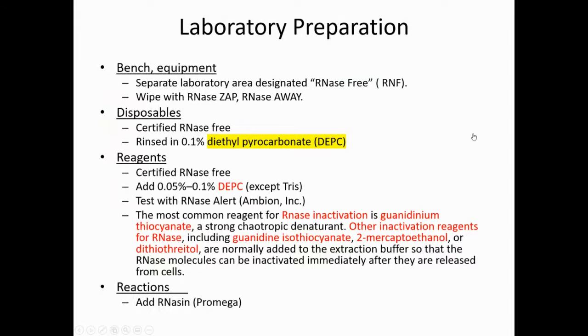And then we continue. This is RNA preparation. It's basically very similar to the DNA preparation, except RNA is subject to RNase degradation.